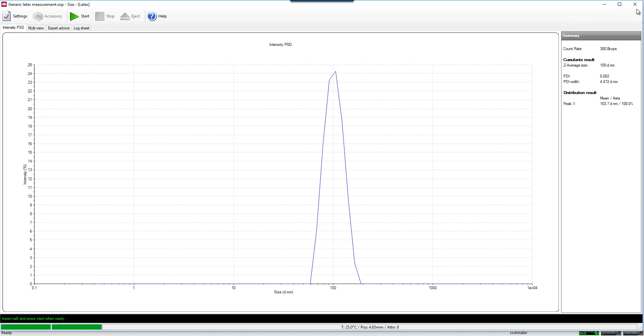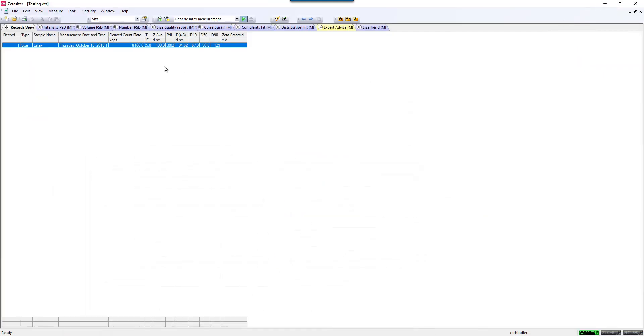Once the measurement is finished, you will now notice that you have a record in your record view. And you can display your sizing result.